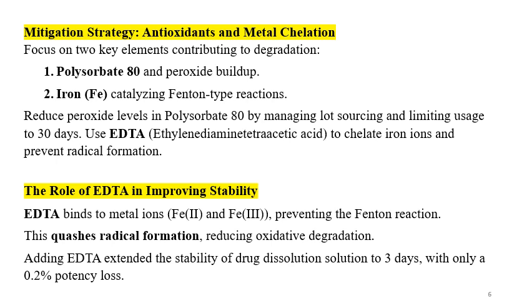Many times the EDTA level or concentration is required to be optimized. Sometimes you can refer to the literature available on dissolution media with EDTA for specific molecules, and you can use those concentrations as a starting point.